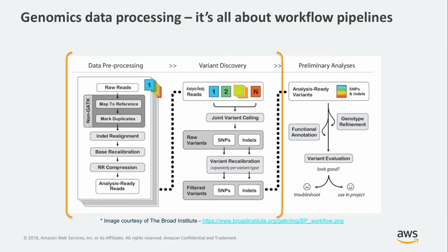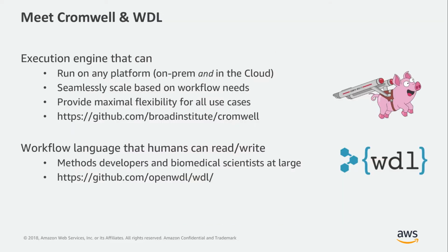So for example, here is the Broad's Genome Analysis Best Practices workflow. As you can see, there are many steps to get to the data that scientists would use for analysis. This is where Cromwell comes into play.